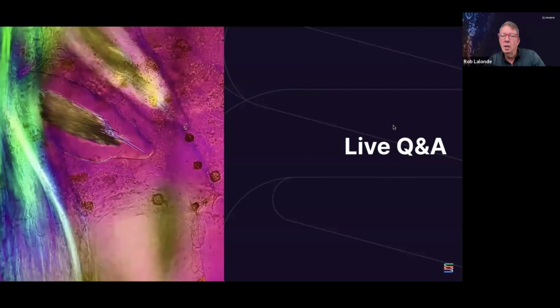Excellent. I see one more question here. When is the next Nextflow training? So I think if you go navigate to the NF Core website under events, you can see the next training that's coming up. That's publicly available. It's the Foundations course, and it is in March. So get yourself registered there, and maybe one of my colleagues can post that link in the chat for you as well.